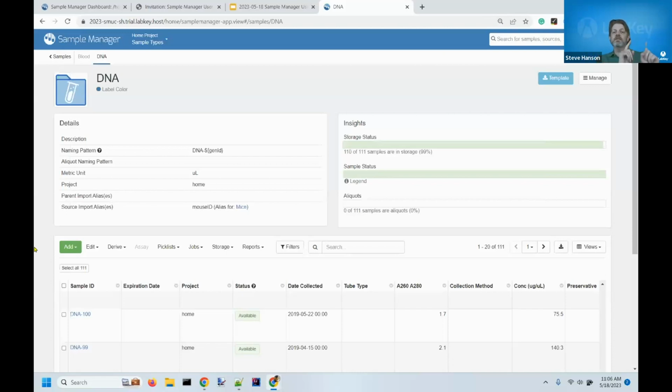Tables are defined once in one place, and then they sort of cascade into or shine into all of the different data partitions. I'm thinking of the DNA table itself, the columns that it has, the data types that it has, those are all shared in common.